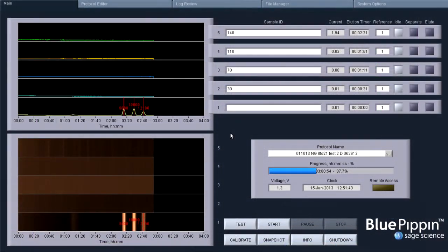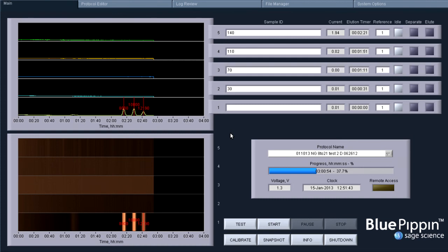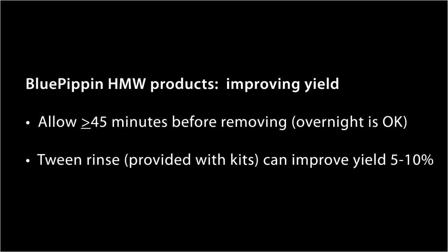At the end of the run, the elution well adhesive strips are removed and diluted fractions are removed by pipette. For Blue Pippin and high molecular weight size selections, we recommend allowing an additional 45 minutes after the run before removal to improve yield. A tween wash can also improve yield slightly.